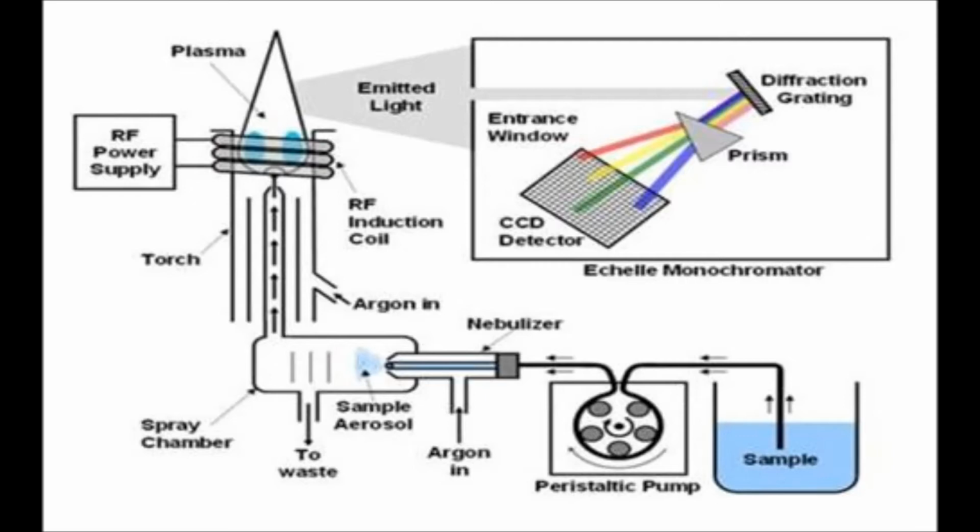Okay? Well, in the ICP instrument, we're going to take your liquid sample. There's a pumping system and a nebulizer to make a spray out of that liquid sample. And that sample is going to be introduced into the high temperature plasma. In that plasma, your sample is completely obliterated. Any kind of molecules, any compounds, any complexation, any solvation, all of the stuff is just completely consumed in the plasma environment. The elements that are in your sample get consumed and atomized to create free atoms or free ions of all of the elements that are in your sample.